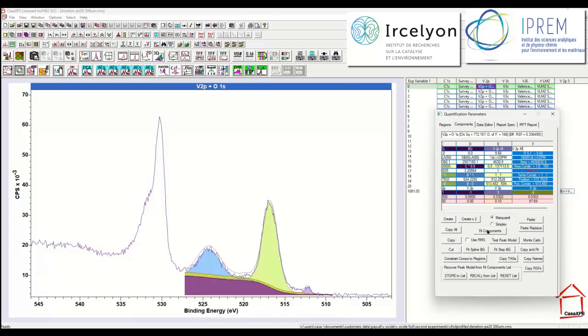And then if I say fit, I start to see an adjustment to the peak model. It's an adjustment to the background, in fact, predominantly, that is perhaps again not entirely warranted, because I do not wish this to alter in position relative to the photoemission peak, which it has done.